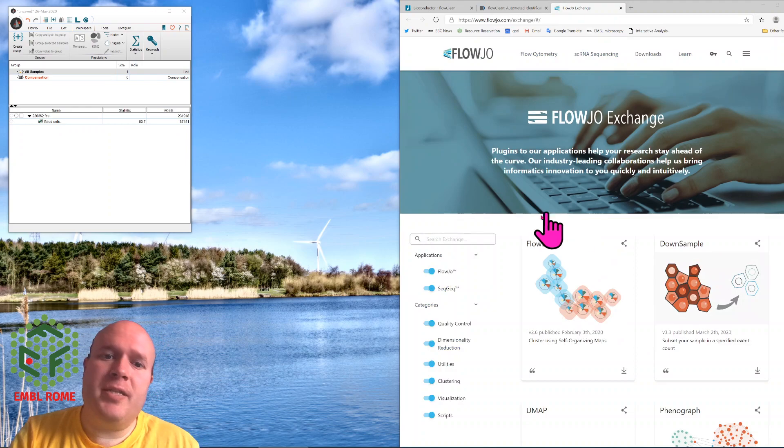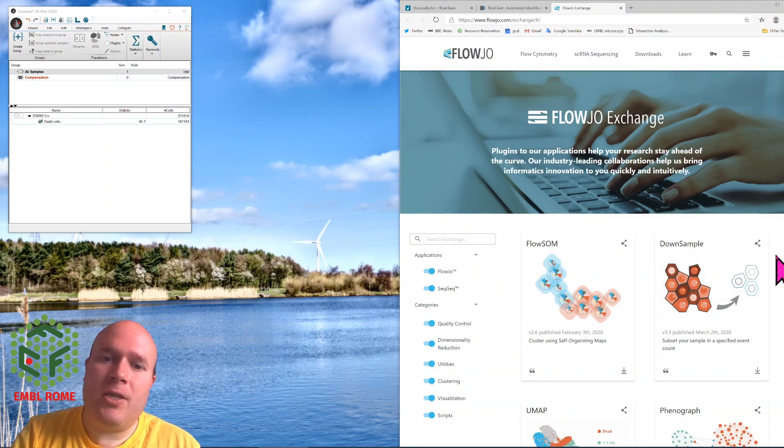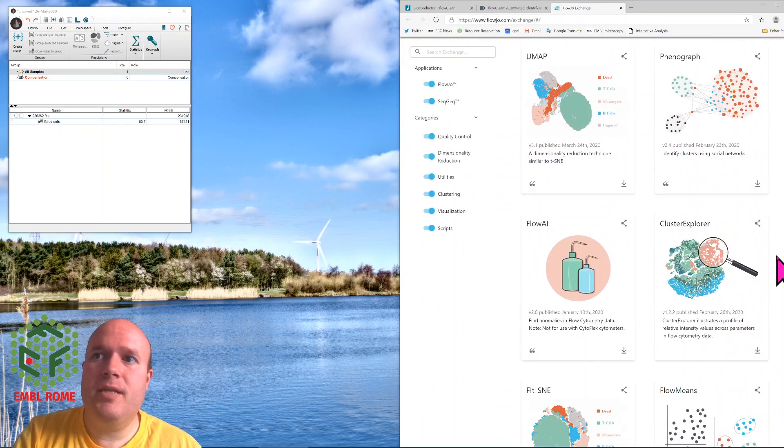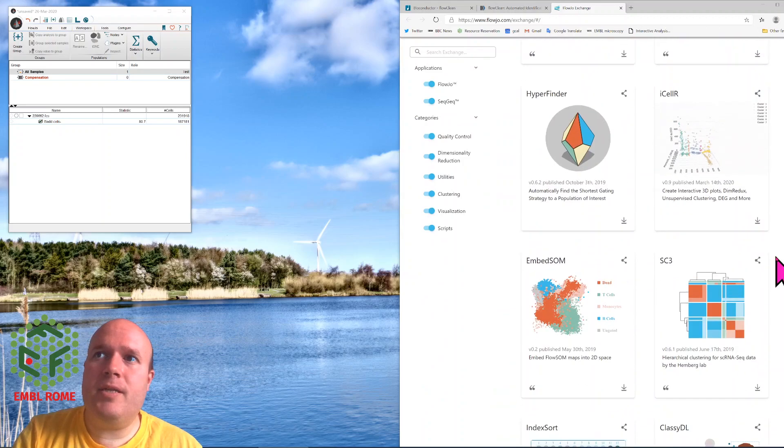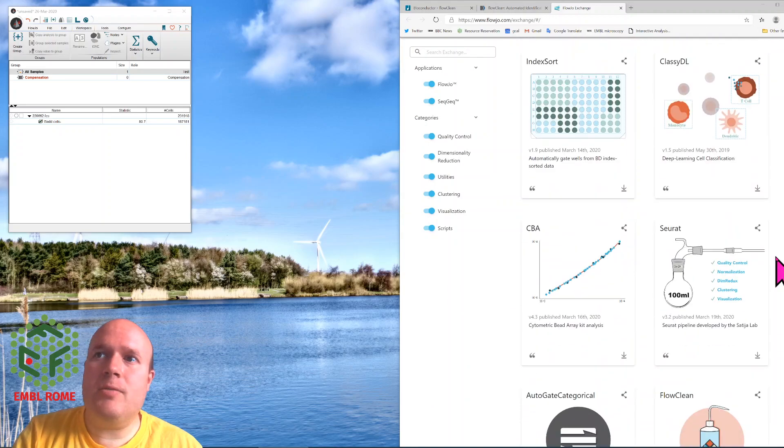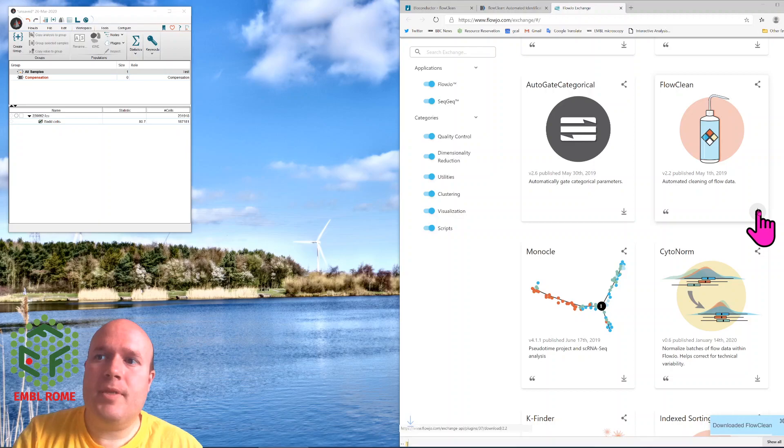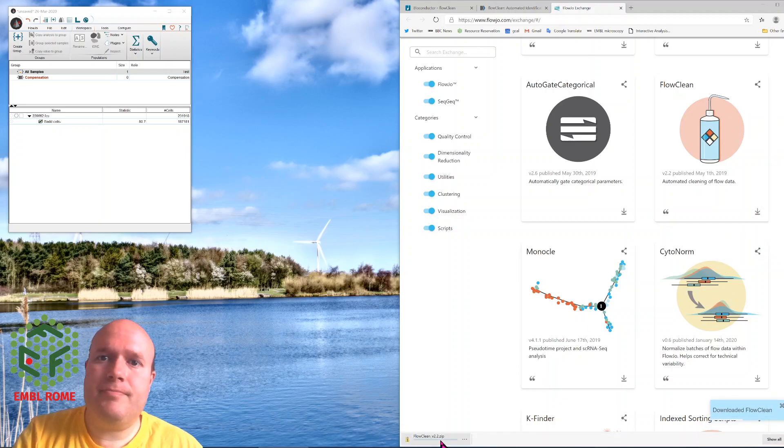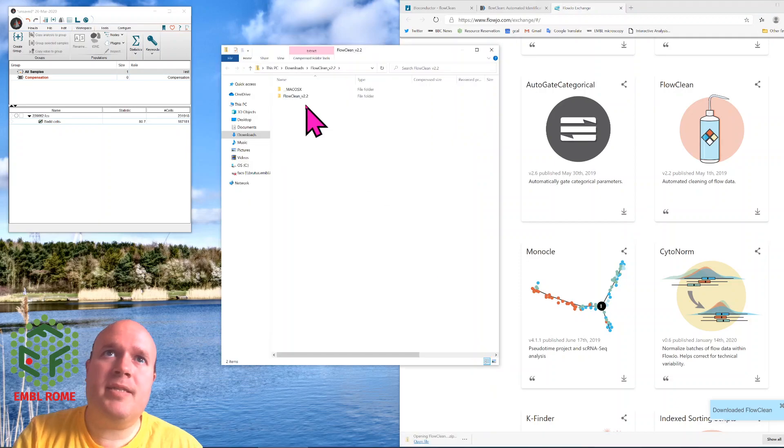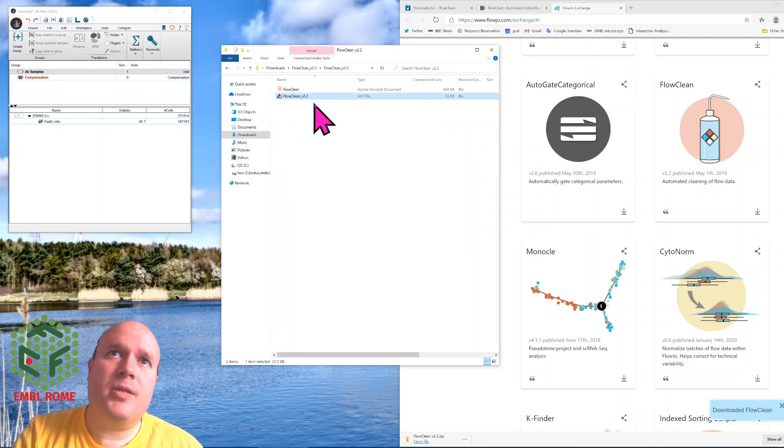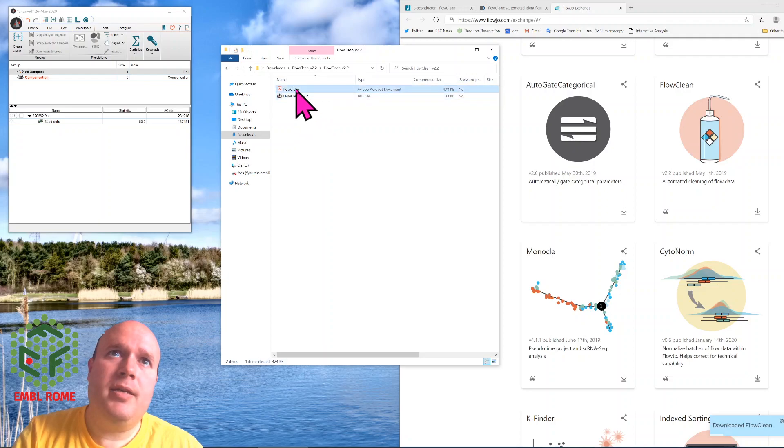FlowJo exchange is where FlowJo keeps all the plugins, and there's quite a lot. We'll go through some of the others in different videos. Somewhere down the bottom you'll find FlowClean. You download it, open it, and inside you will find two files, the FlowClean plugin and the help file.